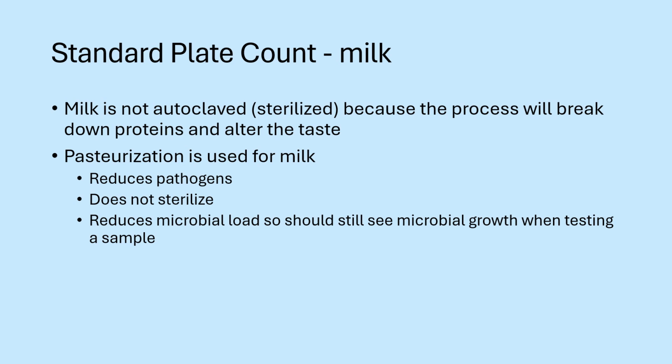But it's not going to kill everything. The idea is it kills the pathogenic microorganisms, but the non-pathogenic ones will still remain. So that's what you're trying to see, is what is that load? What is that number in the milk? Even if they're non-pathogenic, if the number is really high, you don't want to use it for human consumption.